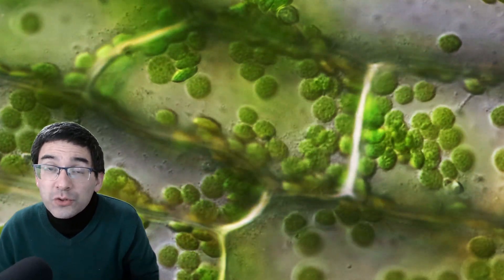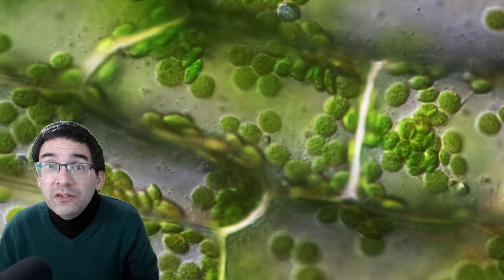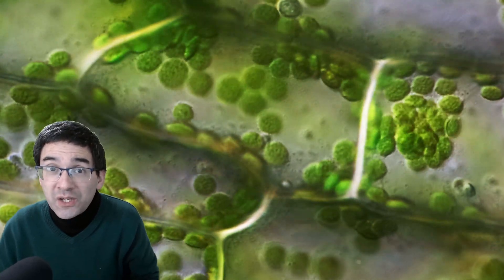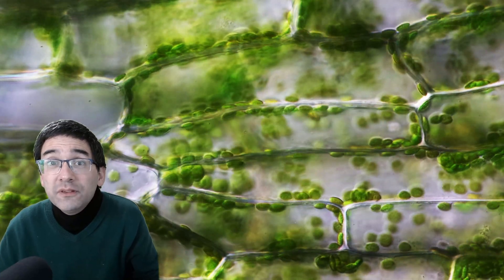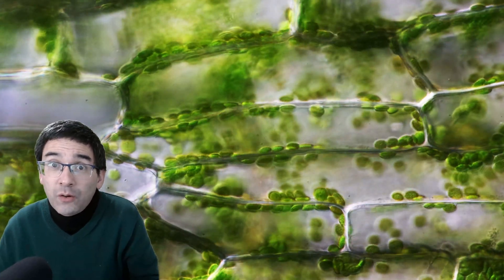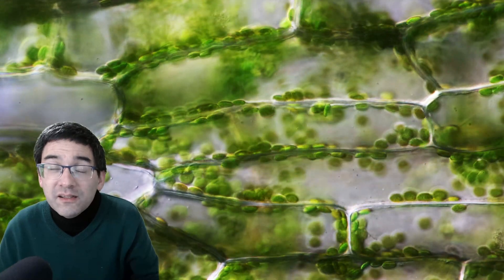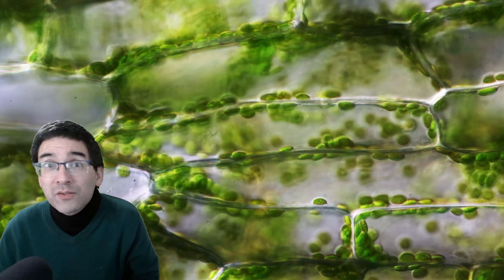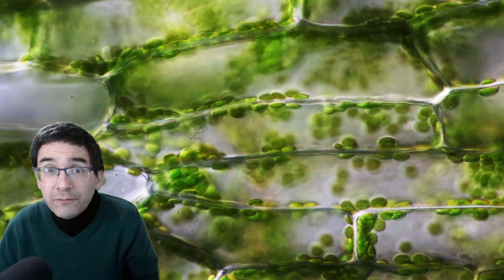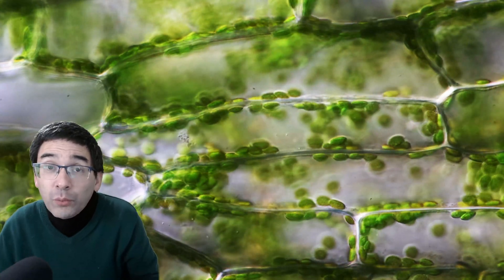When chloroplasts move around, they create shadows. This means different chloroplasts receive different amounts of light over time. These light intensity fluctuations are not very good because plants want a steady flow of light.